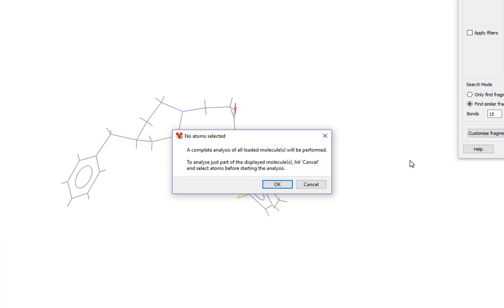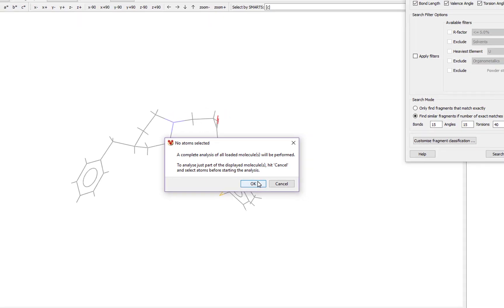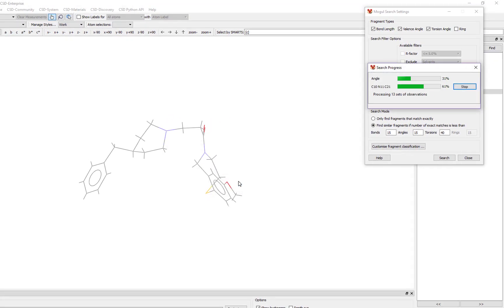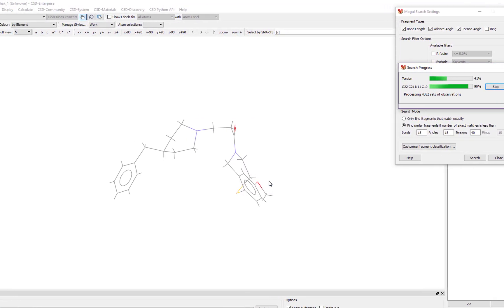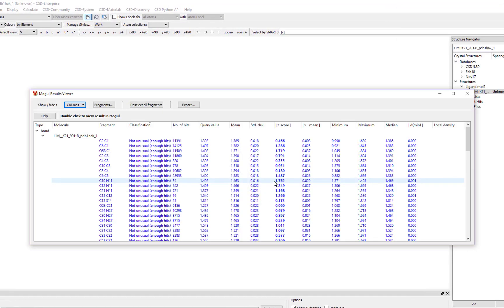The system warns us that it will run a complete analysis of all loaded molecules. Click OK to continue. When the analysis is done, the Mogul results viewer window appears.